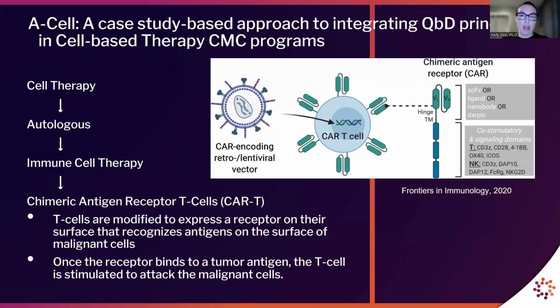In CAR-T manufacturing, the CAR-T genes are delivered to the T cell through viral vectors. And this can be either gamma retroviral vector or more commonly lentiviral vector. And so today I'll be discussing lentiviral vector manufacturing, testing, and stability.